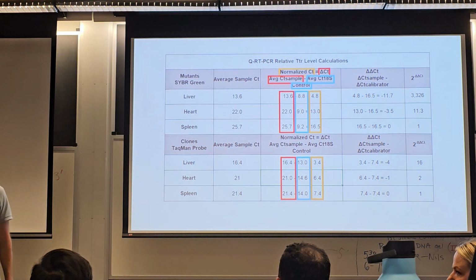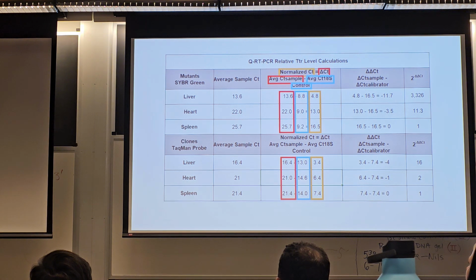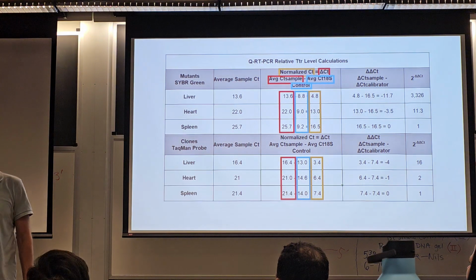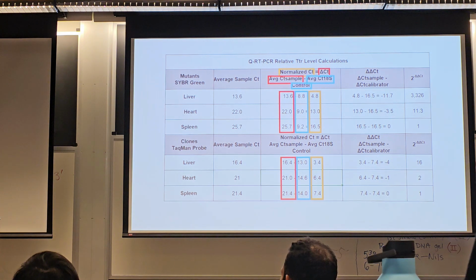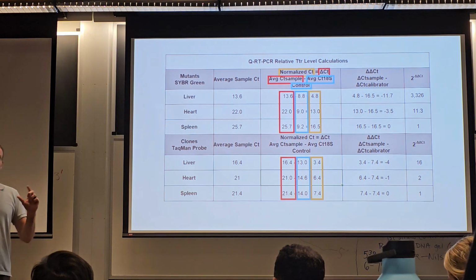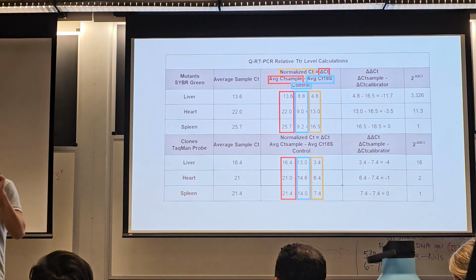Why is it a bit different? You see the pattern? The reason it's a bit different is because when we run this many samples with a class of people, there are a couple of mistakes, and the mistakes mean the results are going to be different. I'm relatively certain there was one group, we won't point out groups, where samples got switched.